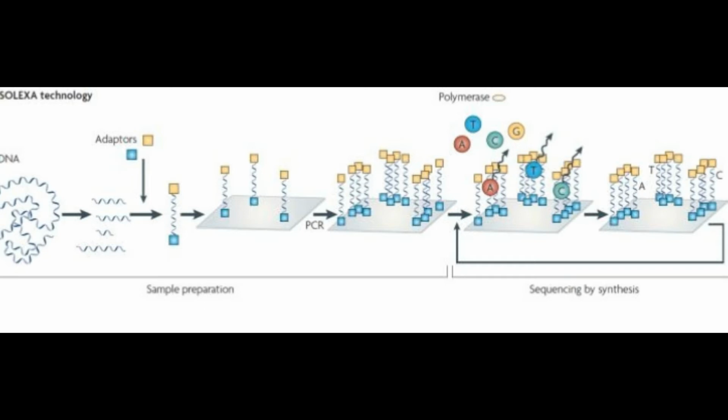It is a way to form the sequence, and it begins by using genomic DNA and attaching it to different adapters. These adapters are oligonucleotides that can join to both ends of your fragmented genomic DNA, and it can attach to a surface.